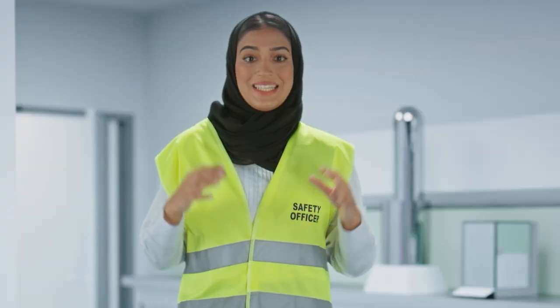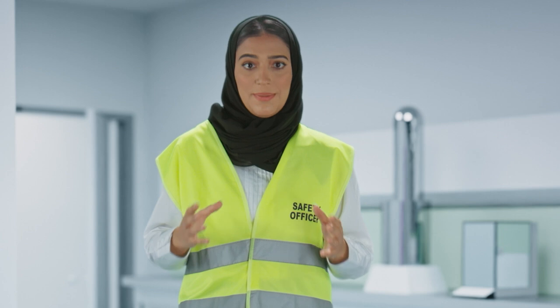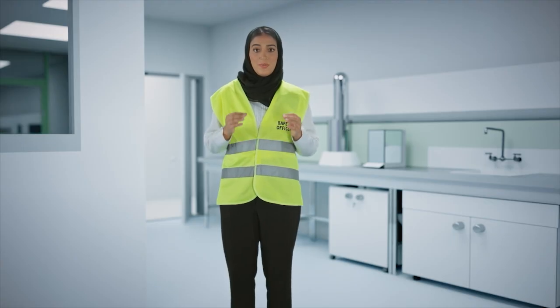Although the laboratory is designated to be a place of learning and skill development, it is essential to prepare to respond appropriately to unexpected events. Even when recognized hazards are appropriately managed, incidents may occur. It is likely that your instructor will be the first to respond to a laboratory incident.